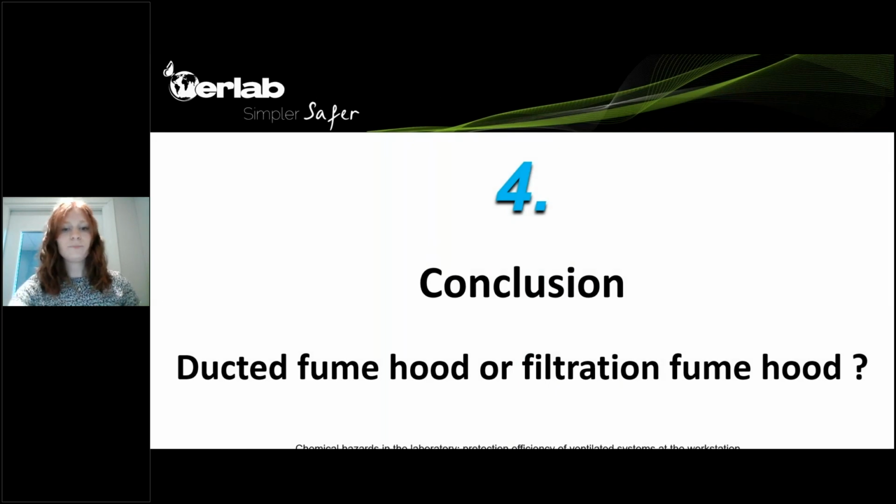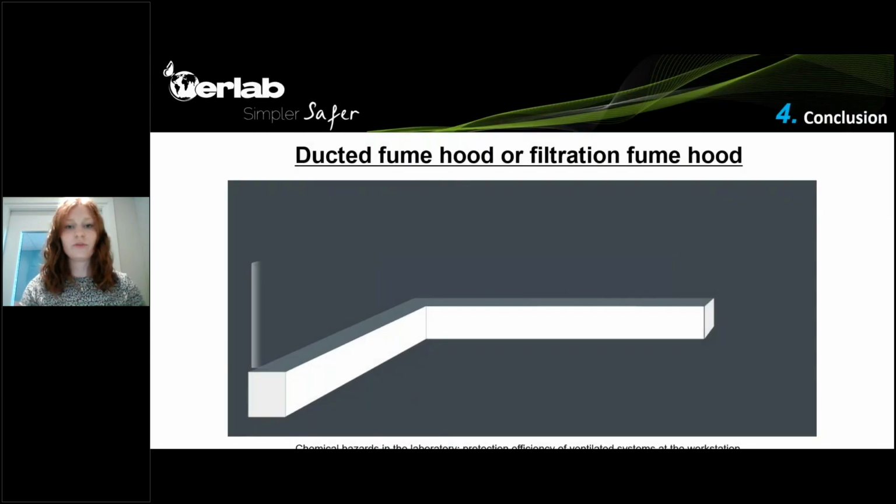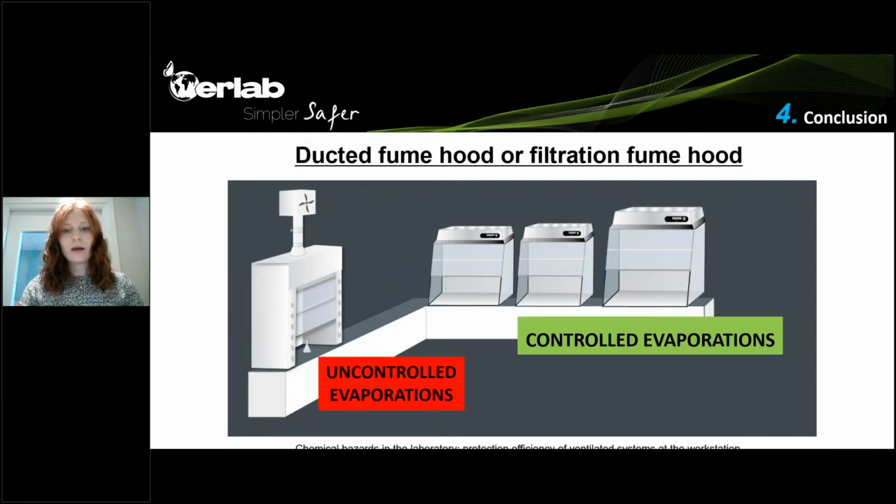So just to conclude on what equipment should be chosen by the laboratory personnel, should we use a ducted or filtration fume hood? What is the safest? The answer is that both ducted and ductless fume hoods need to be used inside the laboratory.